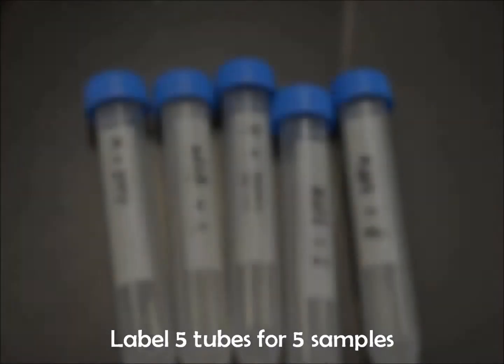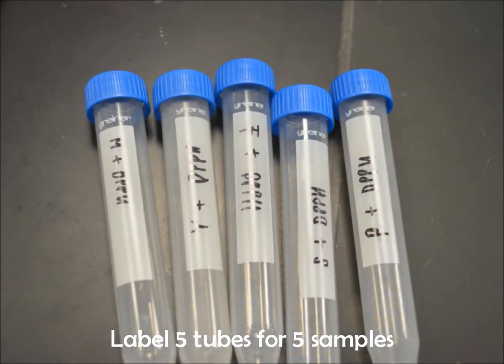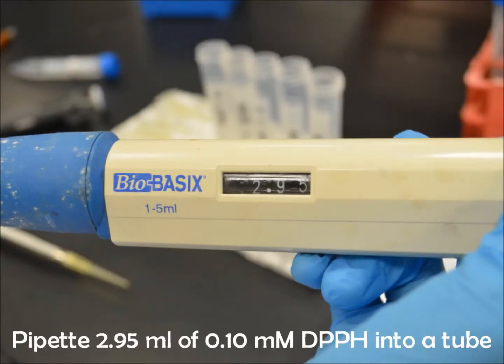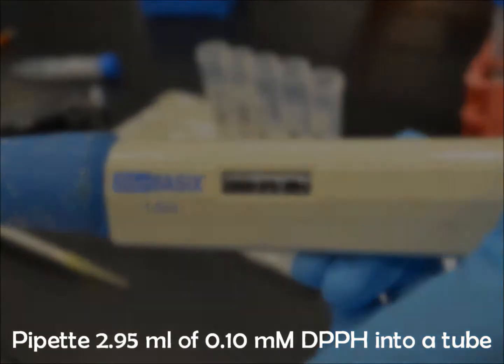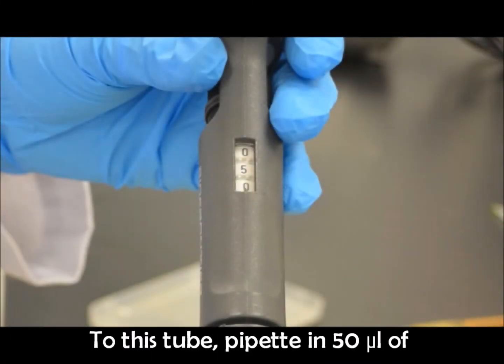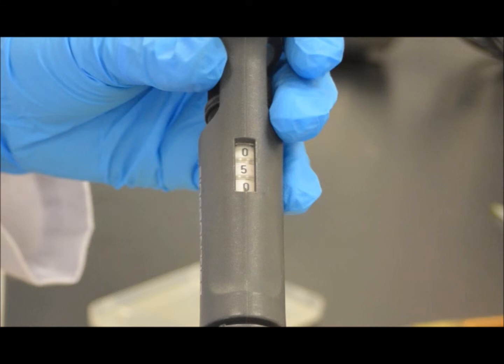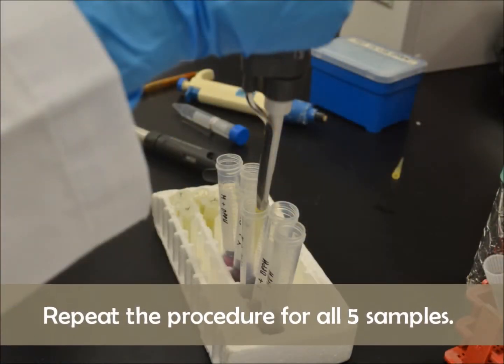Label 5 tubes for 5 samples. Pipette 2.95 ml of 0.1 millimolar DPPH into a tube. To this tube, pipette in 50 microliters of vegetable extract sample. Repeat the procedure for all 5 samples.